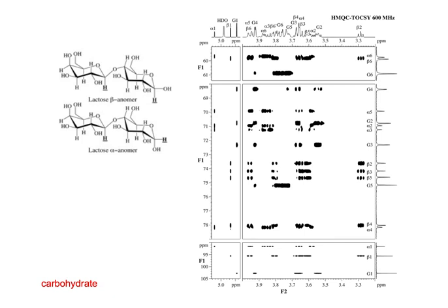So here's another. There's all kinds of combinations of different experiments as well. This one is called an HMQC-TOCSY experiment. Remember, the HMQC is showing a 1-bond carbon-proton coupling.